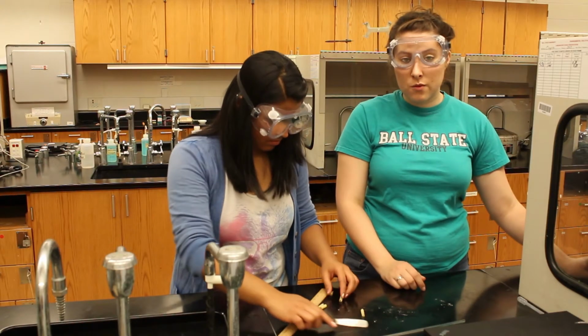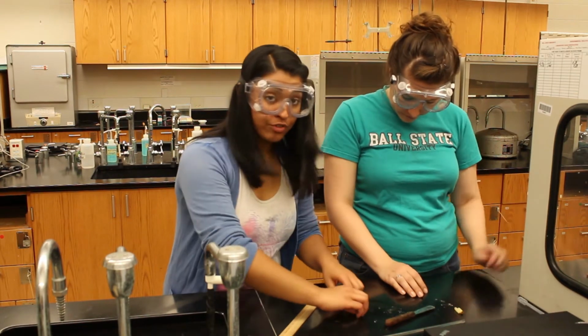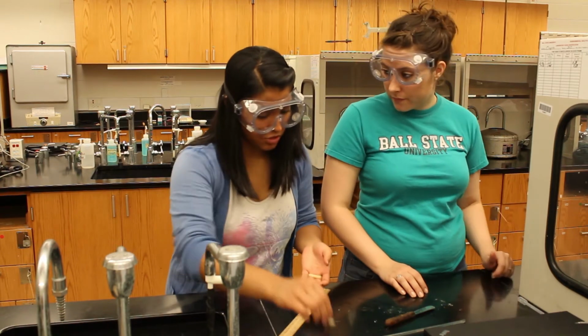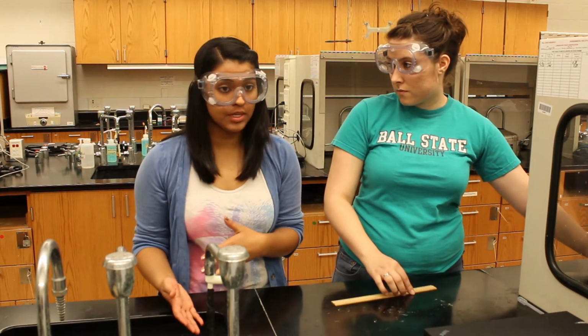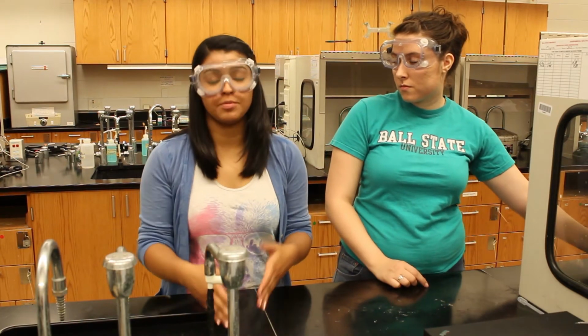So go ahead and continue on with the rest of your lab while you're waiting for these 45 minutes to be up. After the 45 minutes has expired, you'll remove the potato pieces and remeasure their textures, lengths, and masses. By comparing the potato pieces before and after the 45 minutes, you can make conclusions about whether the water flowed into or out of the potato pieces.